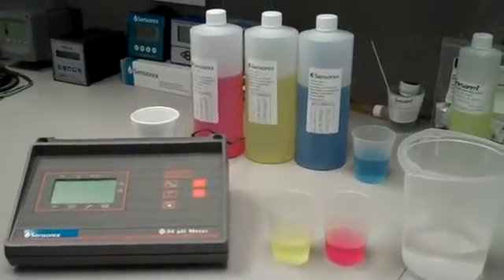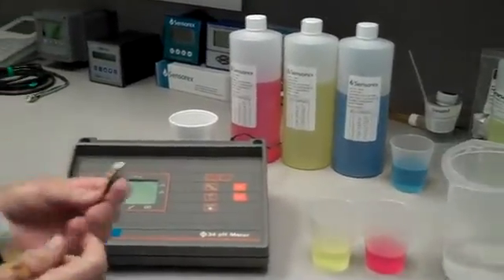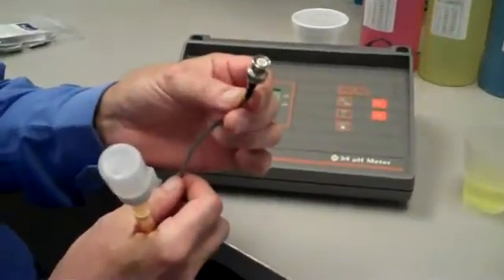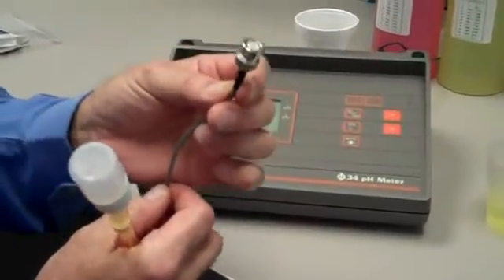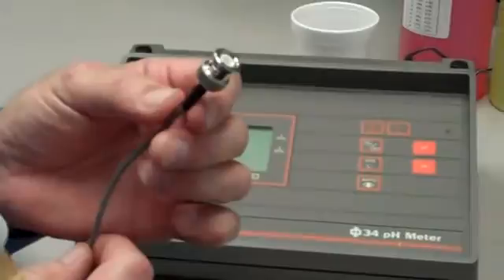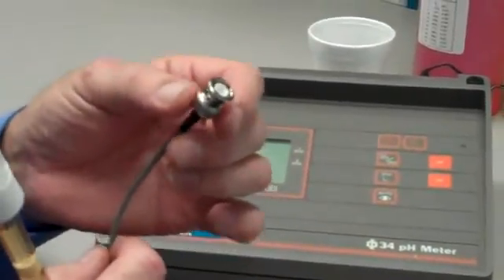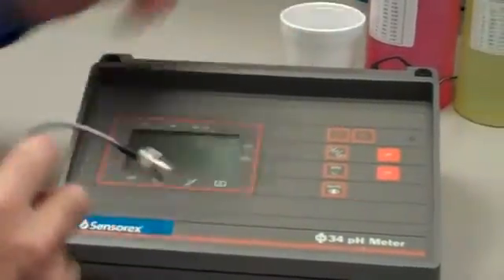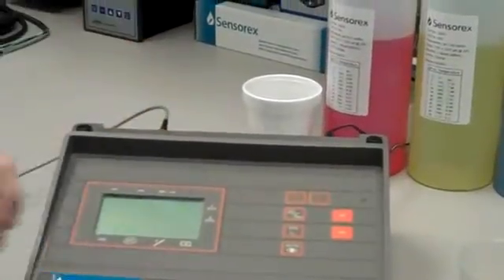When calibrating a new pH electrode for the first time, you'll need to examine the cable and the connector that comes with the sensor. In this case, I'm using the popular BNC coaxial connector. It's a press-on and twist-to-lock, so I will connect it to the receptacle in the back of the meter.